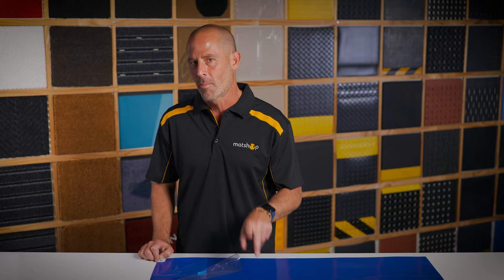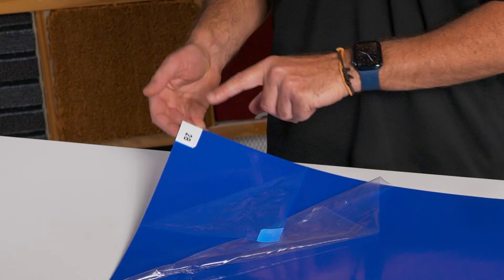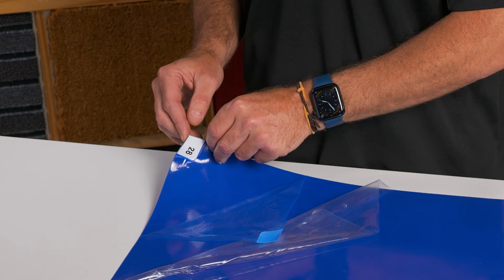There are 30 sheets in each product, so these sticky mats do last a while. Plus, each sheet is numbered so you always know how many you have left.